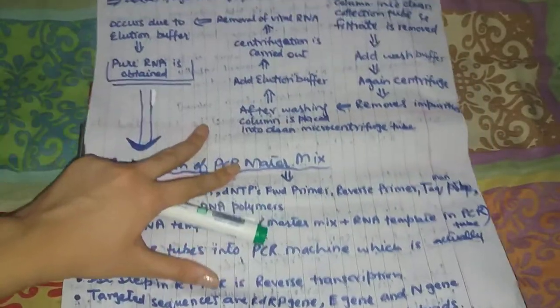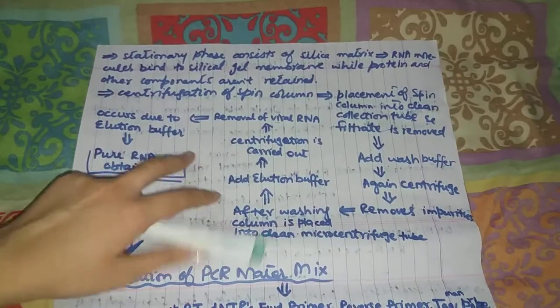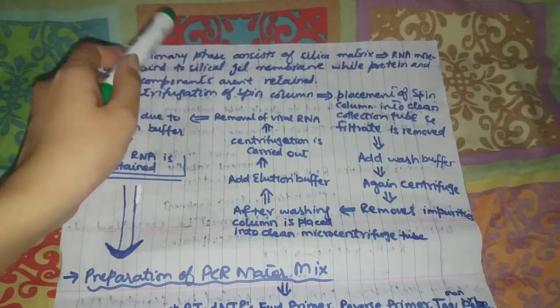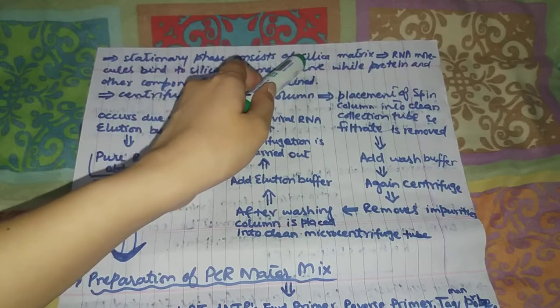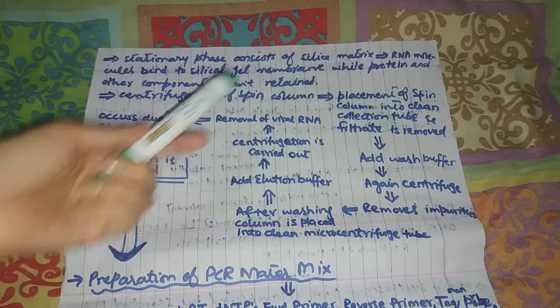In this solid phase extraction, the stationary phase consists of a silica matrix. That's why we call it solid phase extraction.